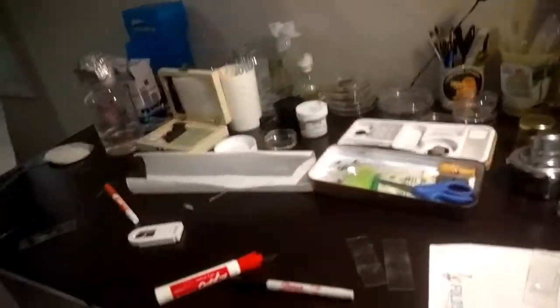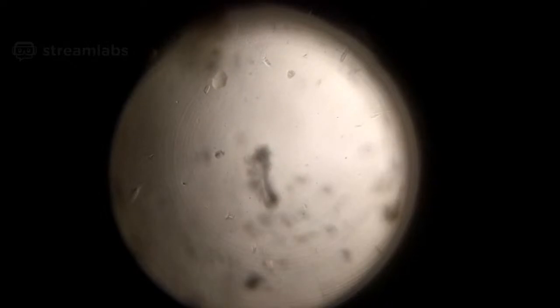And I'm going to show you a very interesting trick. A light trick with amoebae. Okay, so now let's put this on. Do we have enough charge? Yes. Okay. Let's, where is the, right here? All right. So now again, I'm just using the regular light source. And there you go. What do you think that is? I don't know. Okay, nor do I. Let's just make sure that this, how do you zoom in?